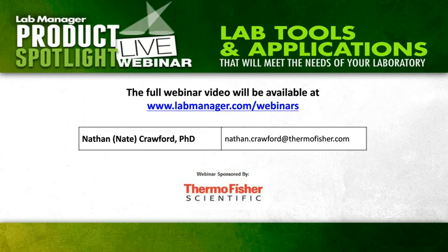Excellent, thank you. Now, our next question asks, what if removing a material from its container destroys its structure? How would you test that type of a sample?